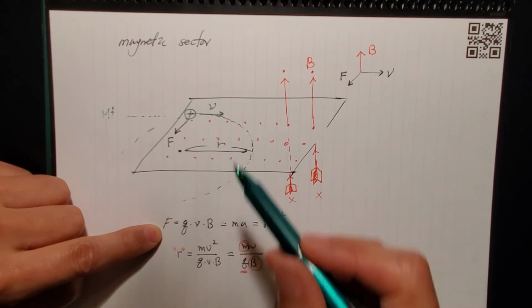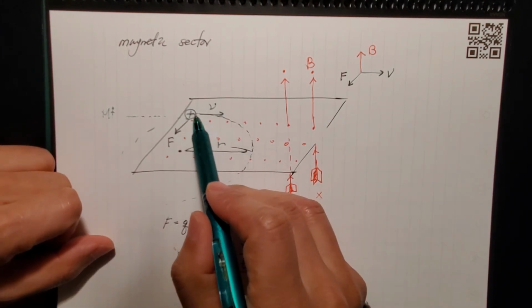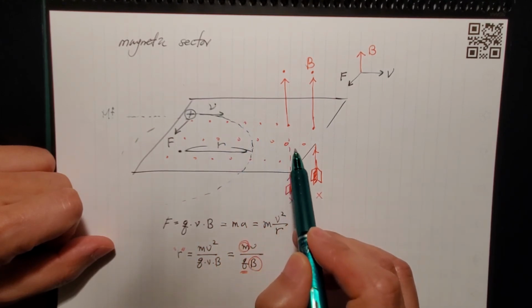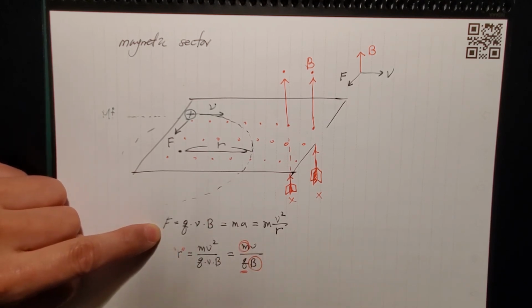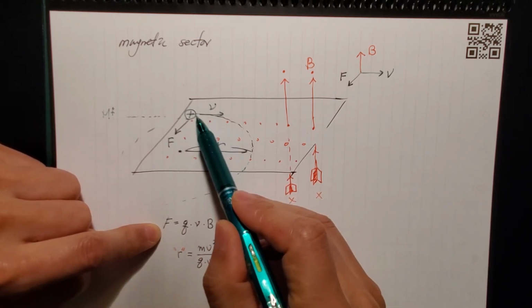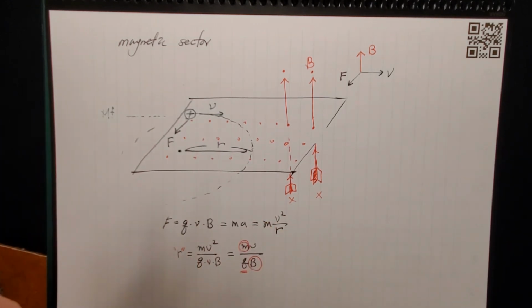The acceleration in this direction is not as much because it's a big mass. So it doesn't curve much, so it goes almost straight, making a big circle. But light ones with a small mass, with the same force coming from the given magnetic field, the light fragment is going to be affected more and curve much and make a small circle. Okay, keep that in mind.